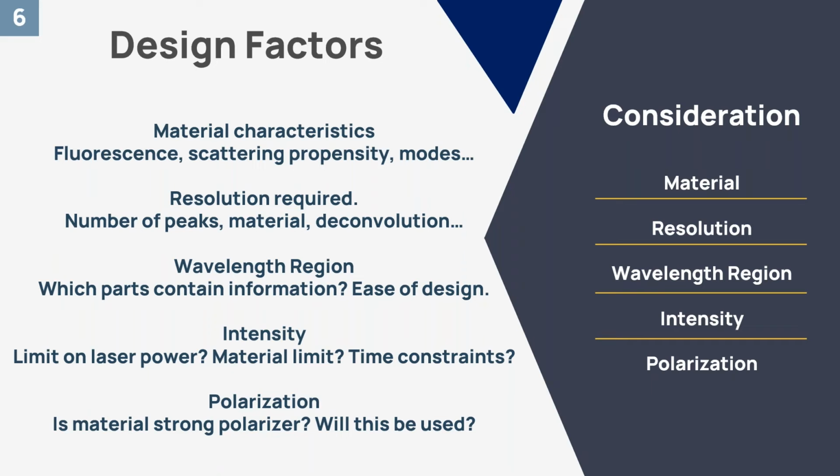That could also be a way around it. But once you've chosen your laser wavelengths, you need to look at the resolution that's required. That's based on the number of peaks, the materials. Are you willing to deconvolute individual peaks if they combine together to form a more summed up structure, I guess? And what kind of wavelength region will you be looking at?